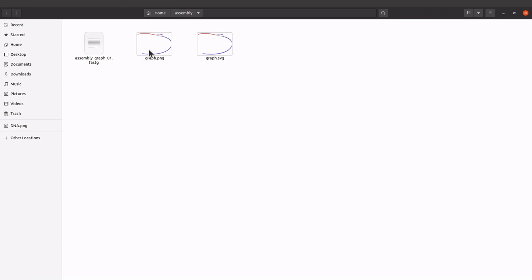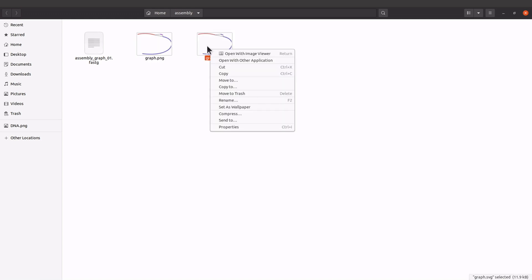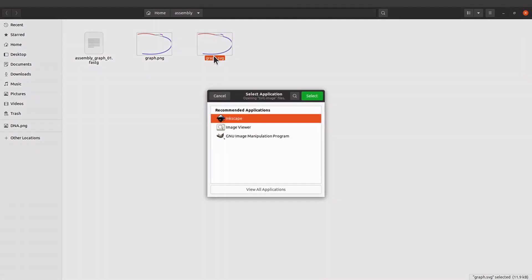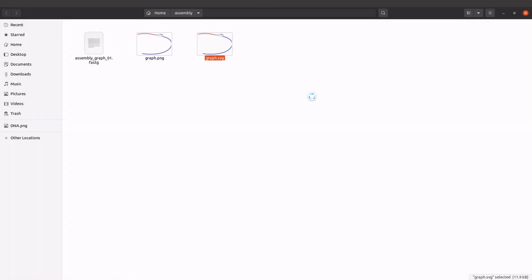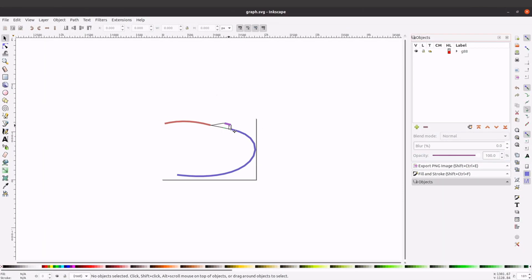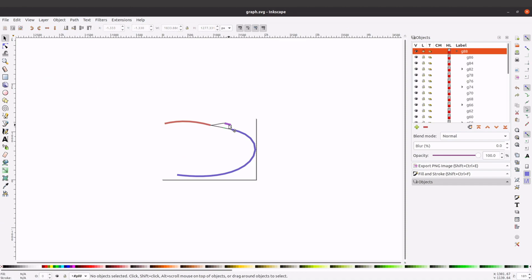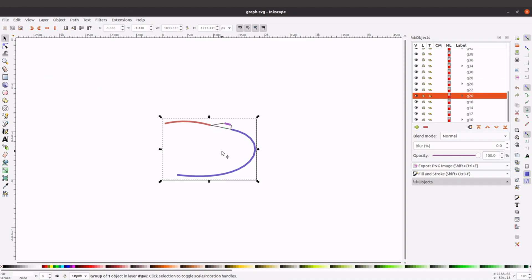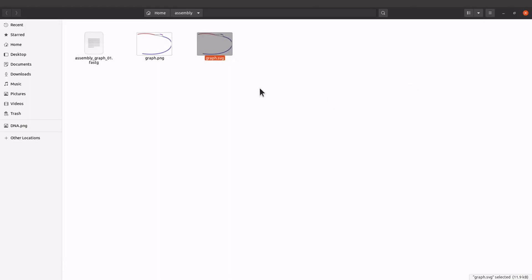Let's go to our folder — the directory which has the assembly graph. We have the images there. I can open the SVG with Inkscape, so I'll just open it. Here I can make changes to it, depending on what you want. Once you have your graph saved as SVG, you can use tools like Inkscape to edit, add labels, and modify it.